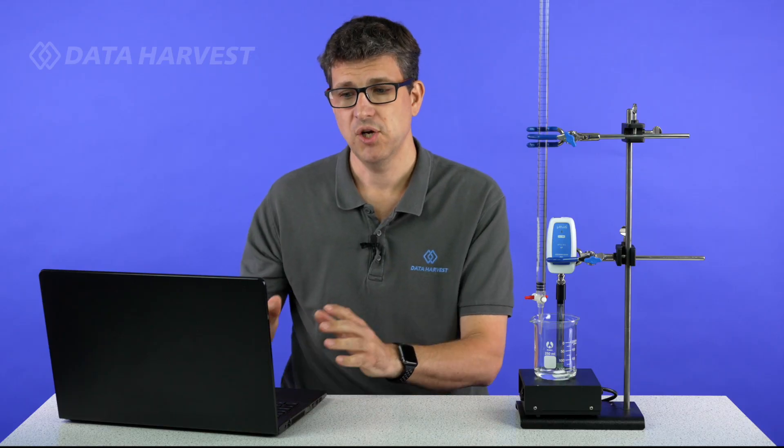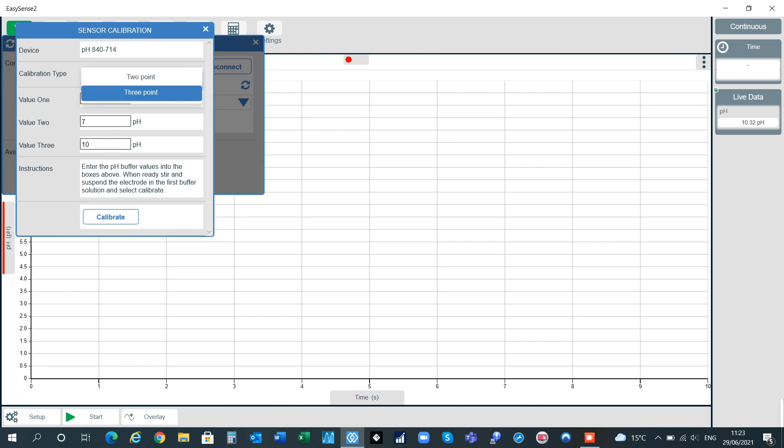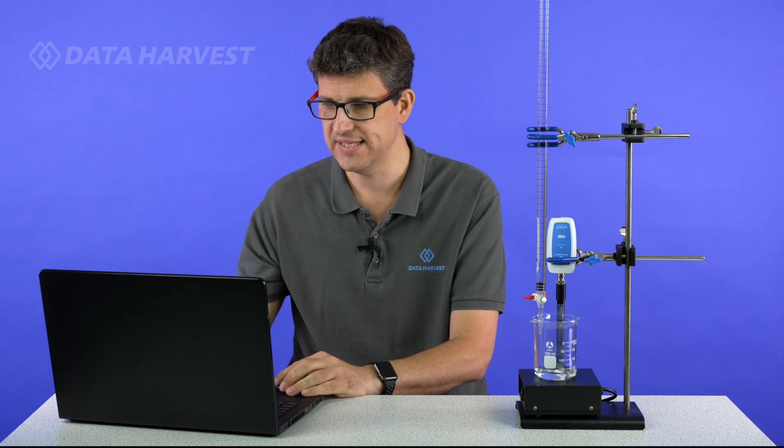Quite often you've got older pH electrodes in the science labs. If you do you can also calibrate the ones you've got. When you first buy them from Data Harvest they are calibrated. As long as you store them half nicely they're absolutely fine but over time they will start to drift so you may need to calibrate them. To calibrate them you just click on calibrate. You can have the three or two point calibration. Default here is four, seven and ten but you can put whichever ones in you want. We don't need to calibrate. Close that down, that's now all connected.